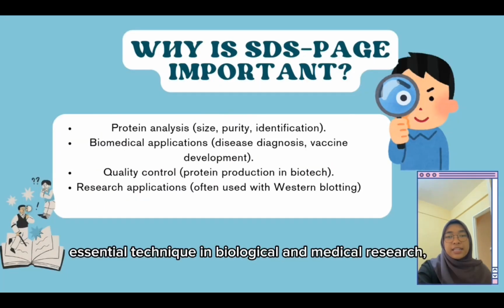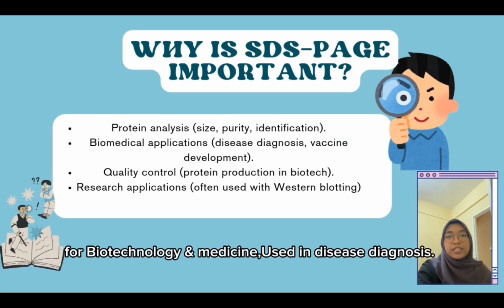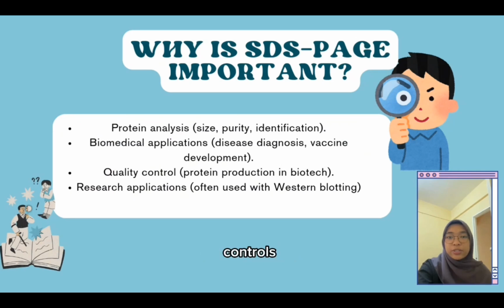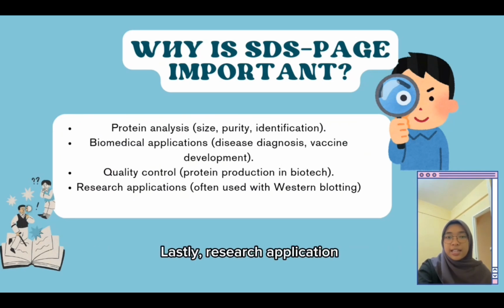SDS-PAGE is an essential technique in biological and medical research with several important applications. First is protein analysis, which helps identify protein purity and molecular weight. Secondly, in biotechnology and medicine, it is used in disease diagnosis, vaccine development, and protein research. Thirdly, quality control ensures proper protein expression in recombinant protein production. Lastly, in research, it is often used in combination with Western blotting to detect specific proteins.